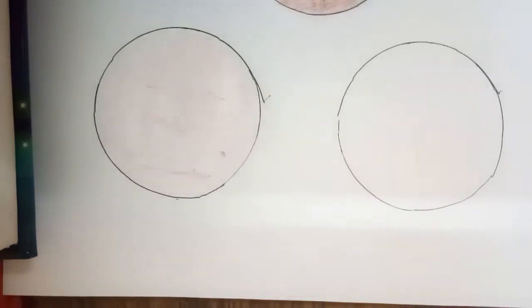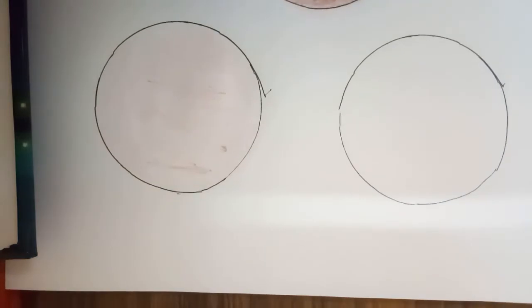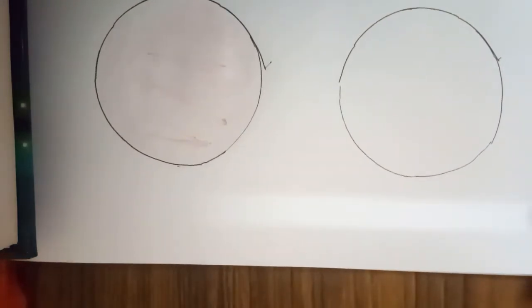Hello second year students, we are starting with the bacteriological analysis of milk. So very firstly we are going to write down here the name of the practical. Okay, so we will write like this: milk analysis. Here analysis of milk is done with the help of certain specific media.